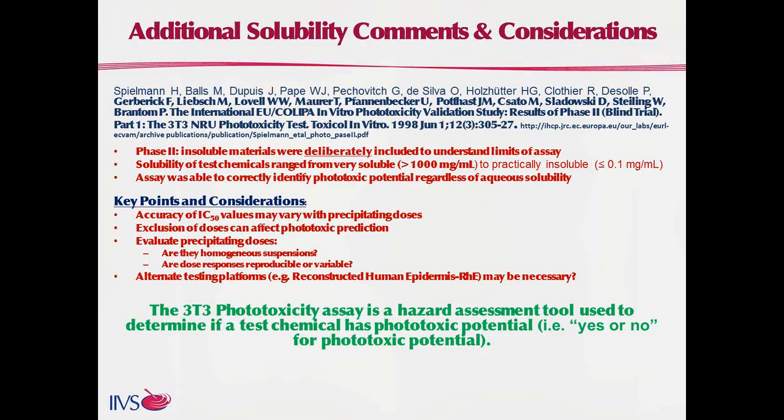regardless of aqueous solubility. So what message do we take home from the case study and the results presented from phase 2? There are different opinions and perspectives on solubility, how to handle it, and I think all have very valid points. From the case study, we have shown that if we assess data only using soluble doses, the phototoxic prediction can be impacted. And in working with test articles which are not completely soluble, they should be handled on a case-by-case basis. When we have precipitation observed, we really need to closely evaluate the results.